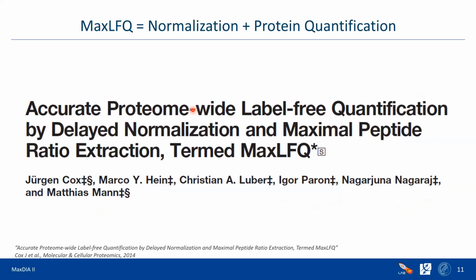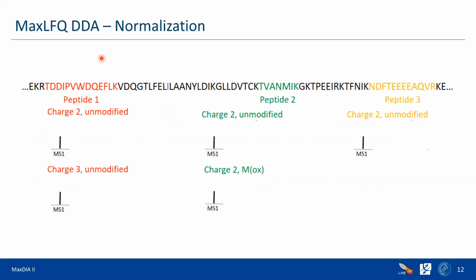So, okay, cool. That was just the preparation. So we did the transfer value, done. We prepared raw intensities. Now what we would like to do is use one of the best solutions which we see in the DDA world for dealing with label-free data, and this is MaxLFQ. As was obvious from Christoph's presentation, MaxLFQ consists of two steps: normalization and protein quantification. So let's just recap how it works.